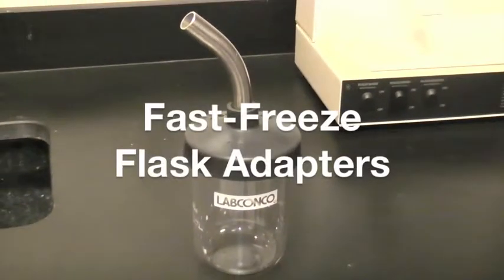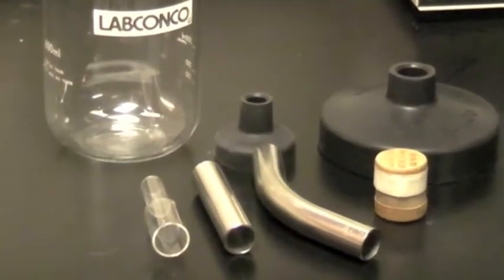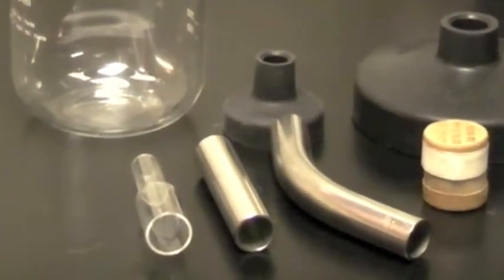LabConco Fast Freeze Flasks can be used with a variety of glass or stainless steel adapters that come both straight or with 45 degree bends.